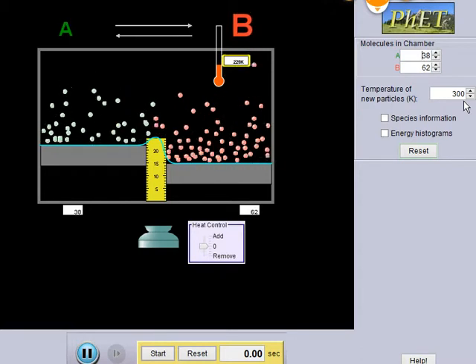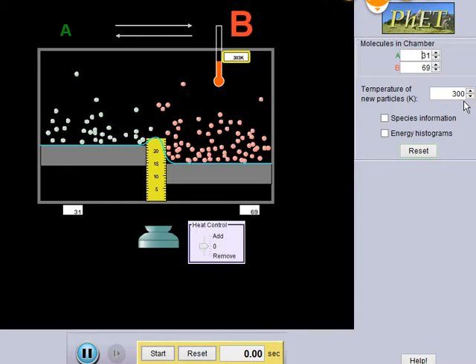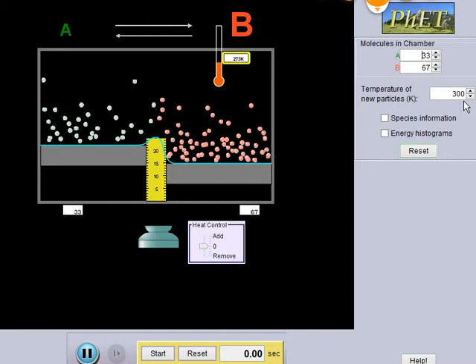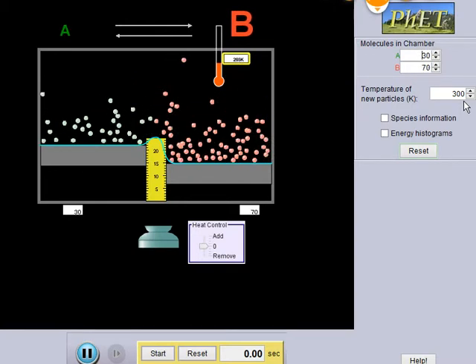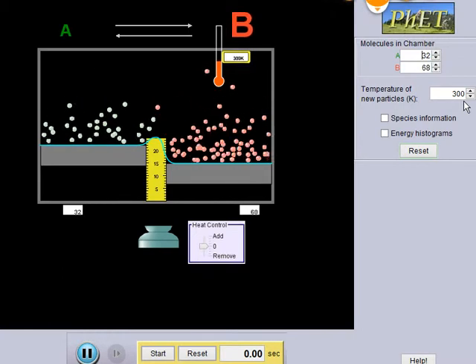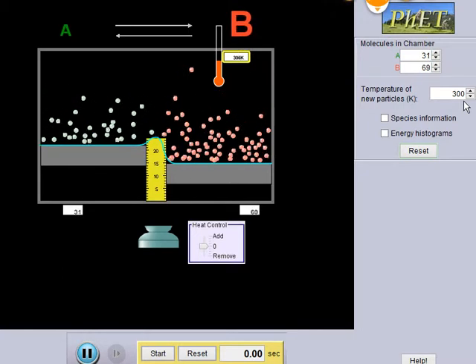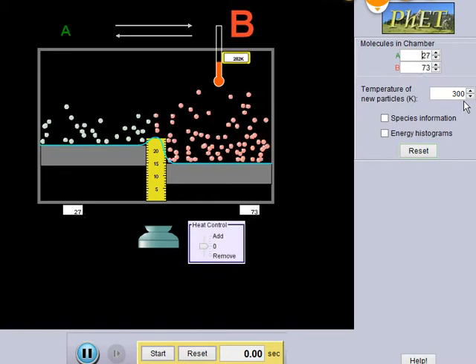So we're going to wait for some time until equilibrium is established. What do I mean by equilibrium? When the concentrations are more or less the same. Yeah, we will take averages. Like right now, let's see if it has already reached equilibrium. I will read out 5 sets of numbers. Please note them down. Do you guys have a pen and paper with you? Everybody has a pen and paper? Okay, I'm going to give you 5 sets of numbers.